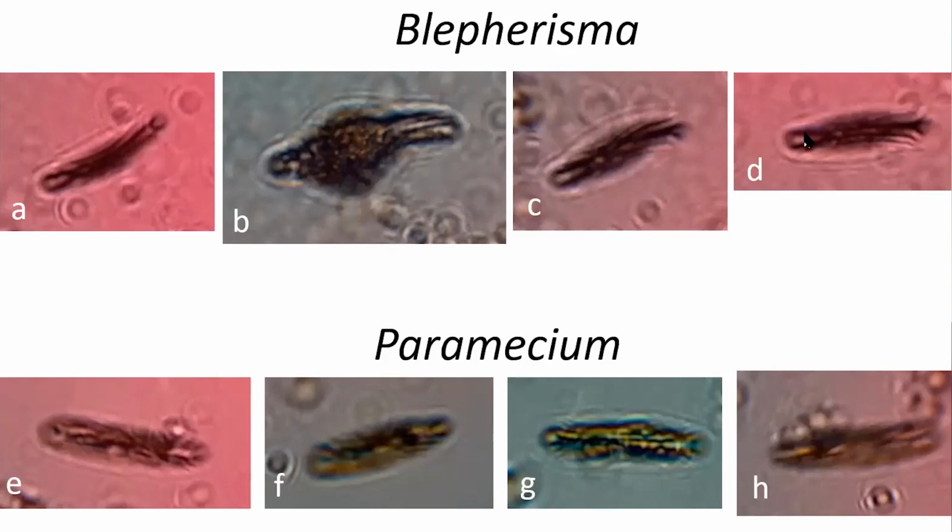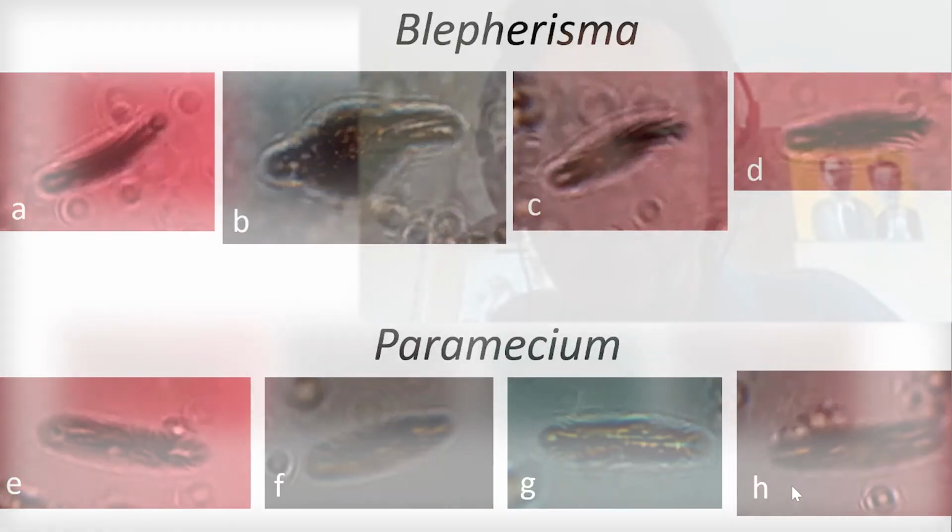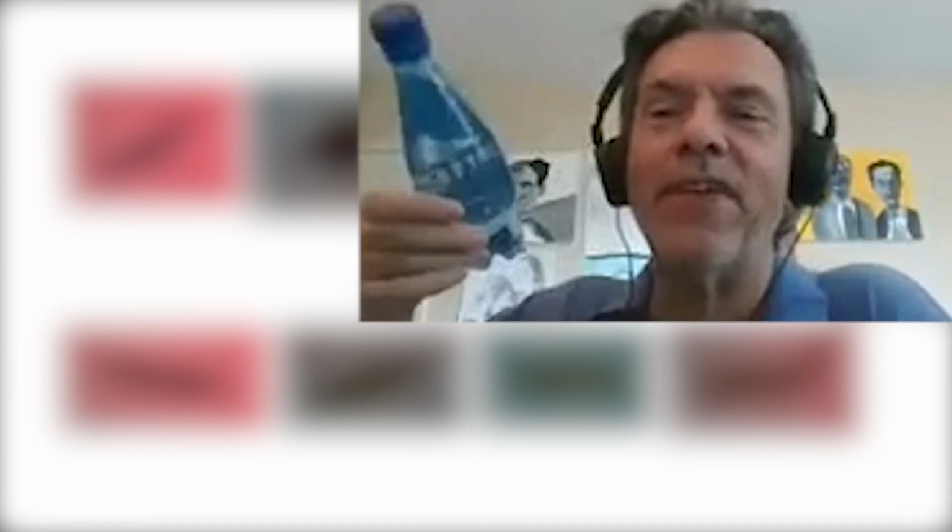And that's why I was mentioning the bottle problem. Well, here's the problem with blepharisma. Some points of view make it look very much like a paramecium. Now, quick solution. Anyone have an idea of how you can approach this problem to help disambiguate blepharisma from paramecium? I'll give you a hint. Remember, we have a movie. So here's the bottle. It definitely looks like a bottle. All of a sudden, it looks like a circle. But remember, it's a movie. We're continually tracking this thing.